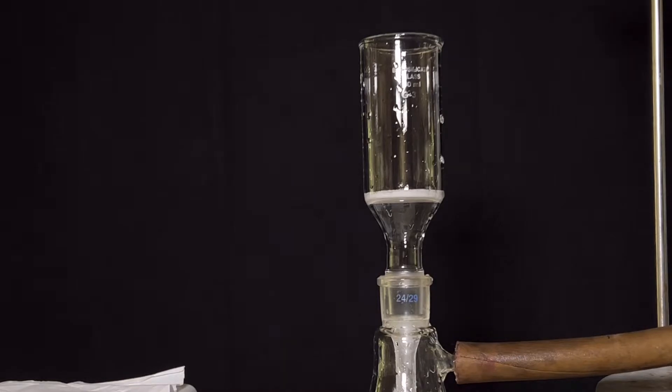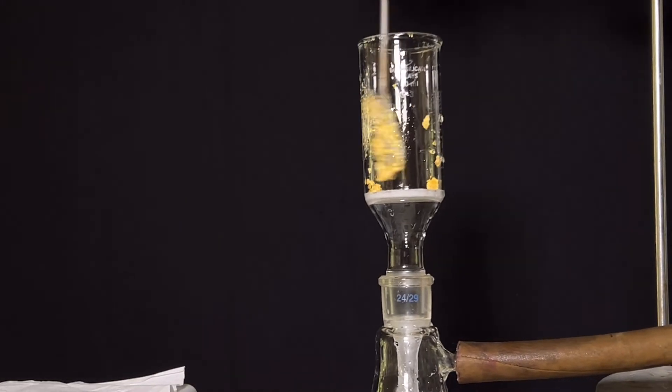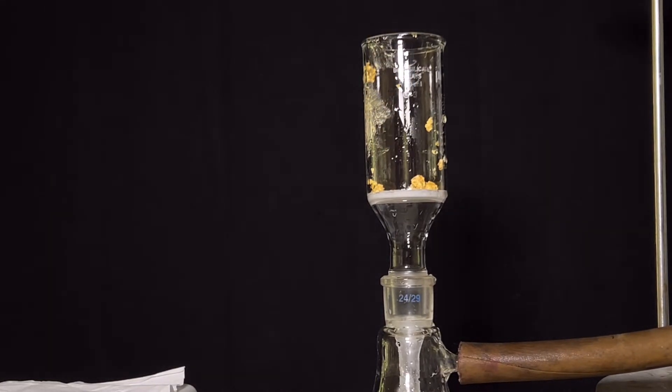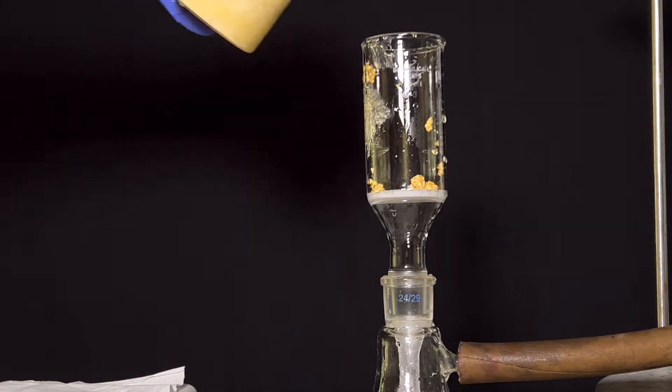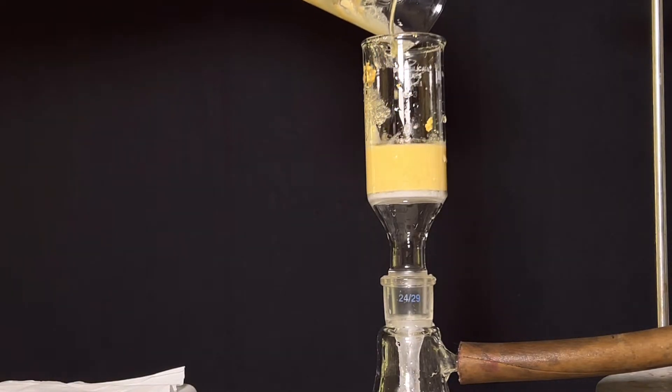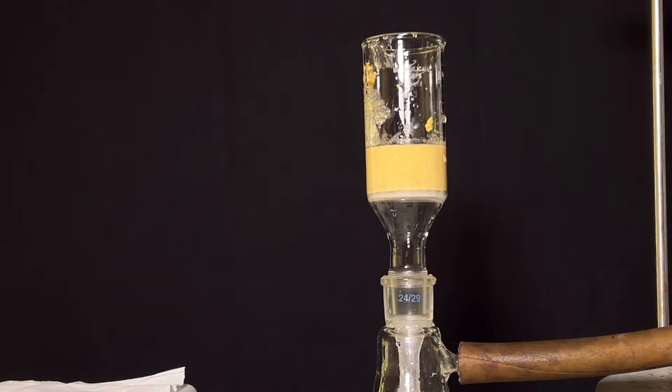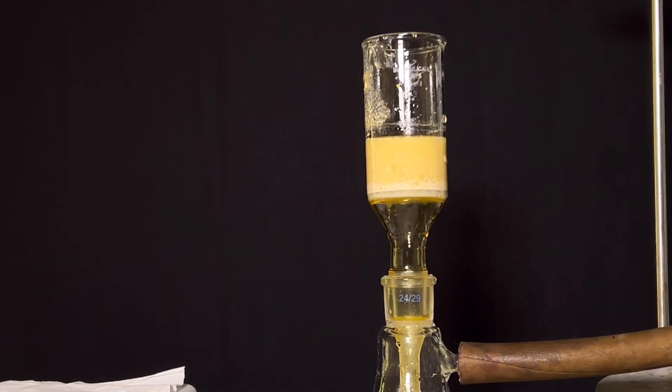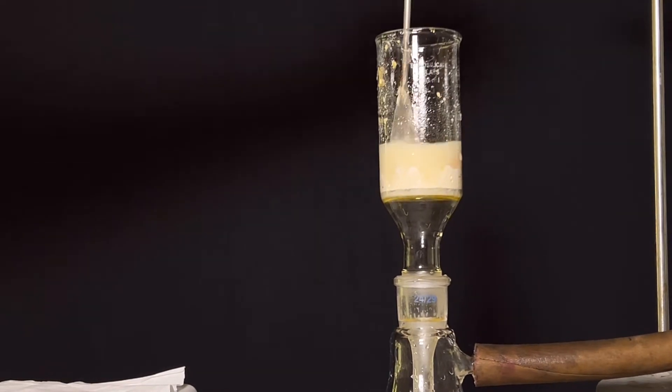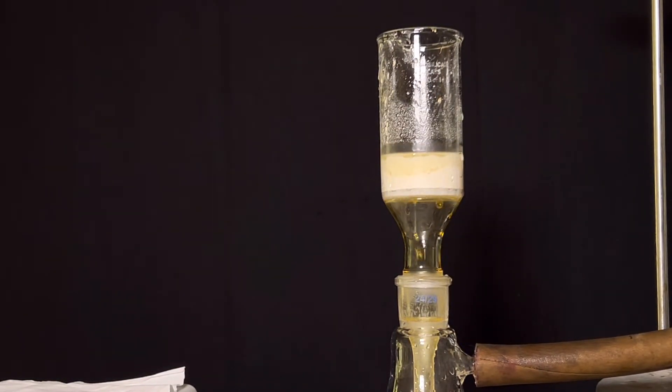Now the contents of the beaker is filtered by vacuum filtration. The contents are very sticky, so I had to use ice cold water to transfer everything to the Buchner funnel and also to wash down the solid stuck onto the spatula. Wash the solid with ice cold water inside the Buchner funnel itself to remove all the water soluble impurities and the compound was filtered.